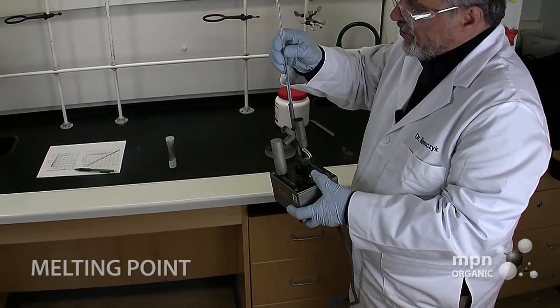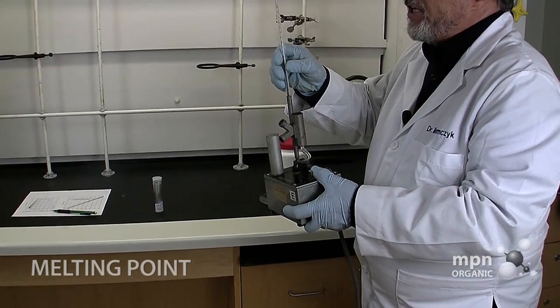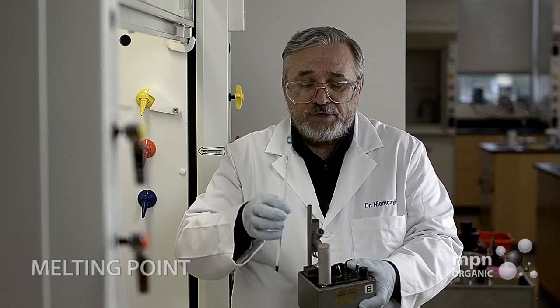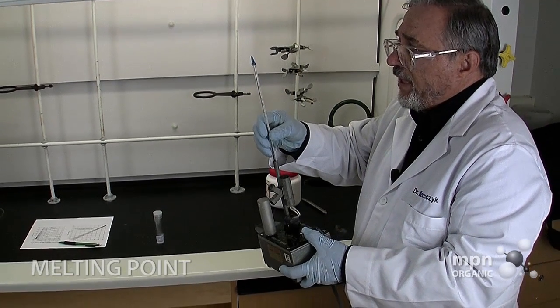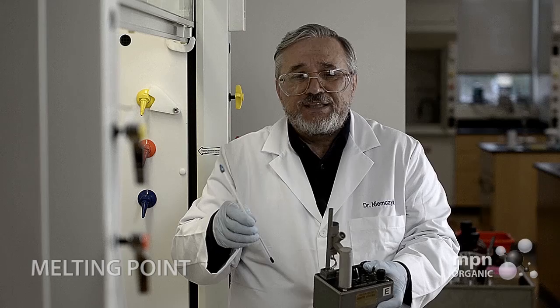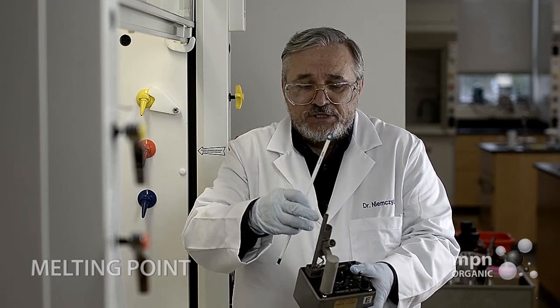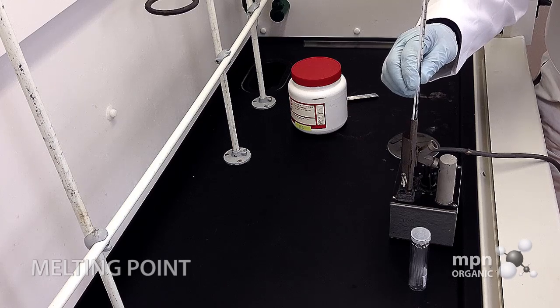Now, I always caution students that before they begin any type of melting point determination, they check to see that their thermometer fits into this little breech right here. If it doesn't, if there's any amount of stoppage from going all the way in, then abandon trying to push it in any further, because we have found that we can't get these thermometers out without breaking them once they are jammed in this tube right here. So this seems to fit okay. I'm just going to put my thermometer in there, like that.